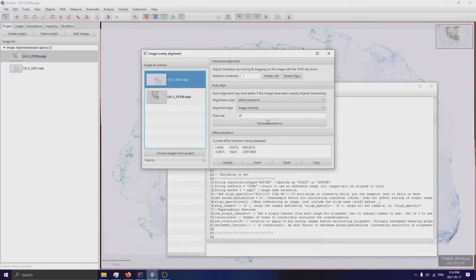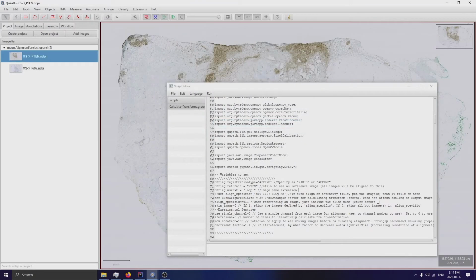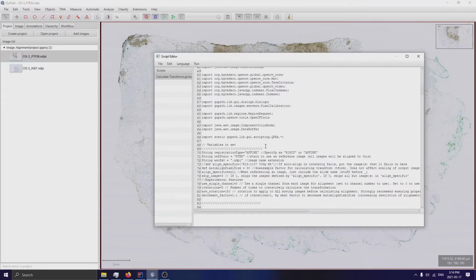Yeah, so you can see it transformed slightly even though it's flipped, and I'll explain how to account for this in just a second. Let me apply it again. It moves again, and it'll basically move and move and move over and over again. Now, that alignment did not work well because the image was flipped by 180 degrees.